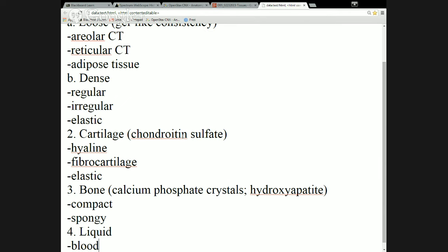What we're going to do for the rest of today and then continue on Wednesday, because it's a little too soon to shift all the way to the skeleton next time, is to look at this stuff under the microscope. So in doing that, what I'm going to have each of you do is look at a particular tissue under the microscope. It'd be great if you could look at all the tissues and get to know what they all look like under the microscope, but it's not really a realistic use of our time.